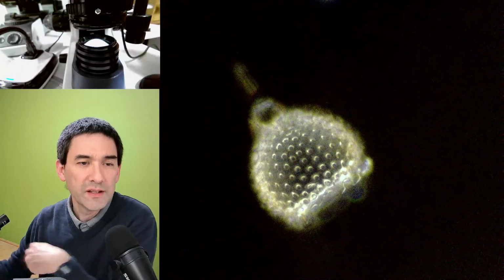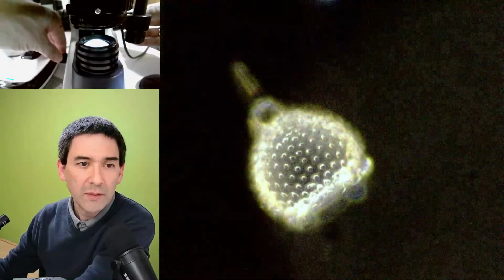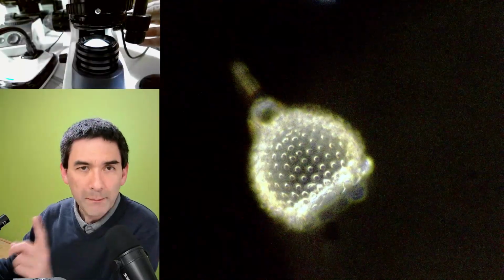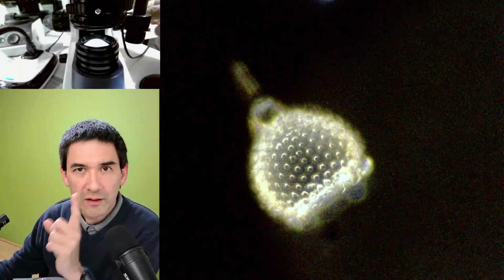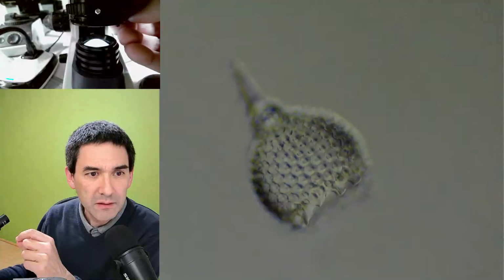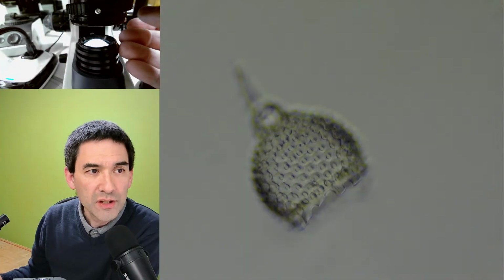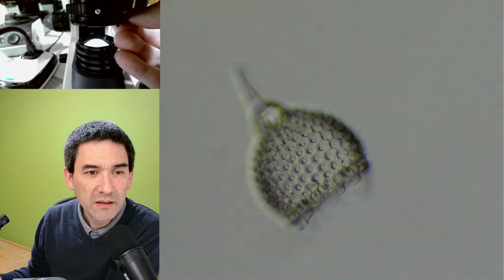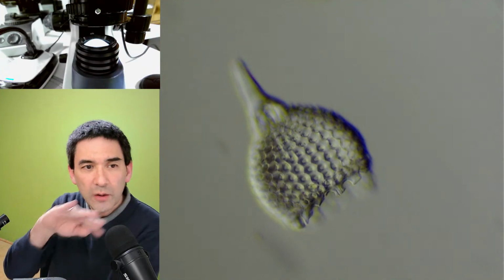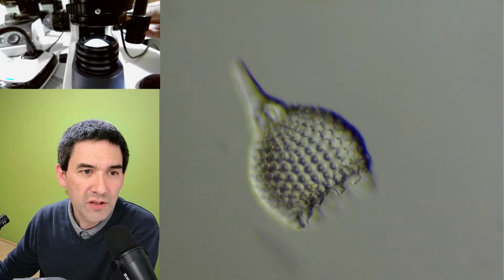What we have over here is a slightly overexposed example, and that's already one of the disadvantages. But now look what happens if I swing out the filter a little bit. Then you can adjust this. As I move it back and forth, you can see the light appears to come from one side, and you get almost a three-dimensional impression, which looks quite nice.